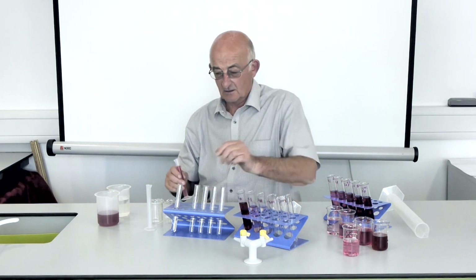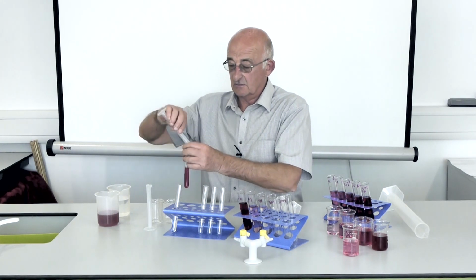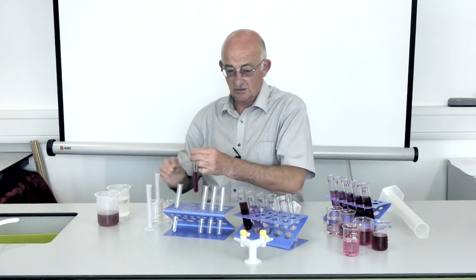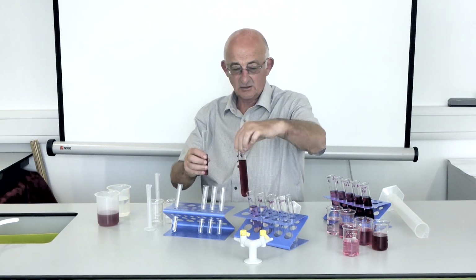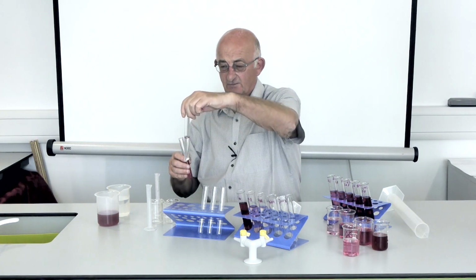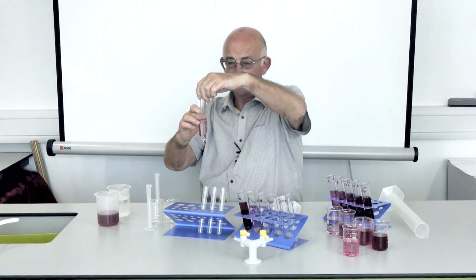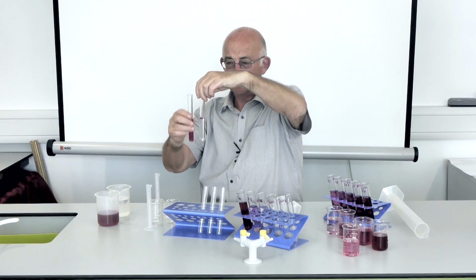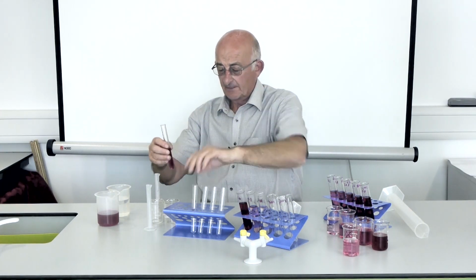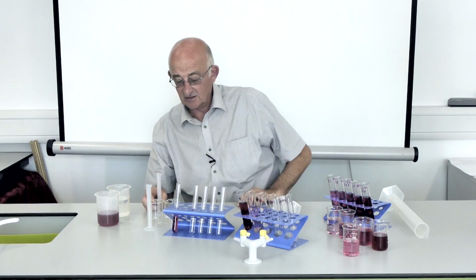So that goes then into my first tube, which is 1.0, so that's the same as that one there. Just for illustration purposes, I've marked on the tube where 10 mil comes up to, just so I know roughly how much we're going to be needing. So I have 10 mil of my starting solution. I've got to dilute that by a factor of 10.